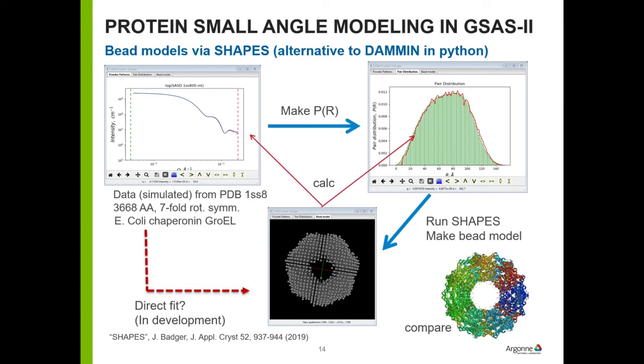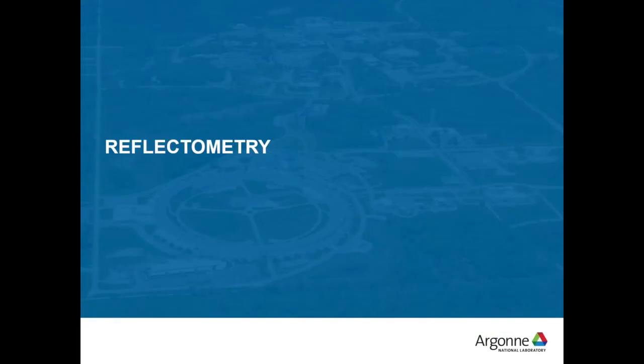Or this is the only thing they can get, because you can't grow single crystals of this stuff. Okay, another subject, reflectometry. This is a case where, and I sort of humorously described this, it was with some people as watching paint dry.